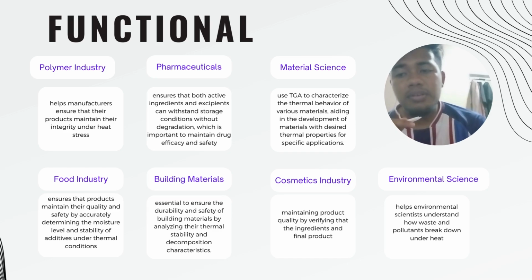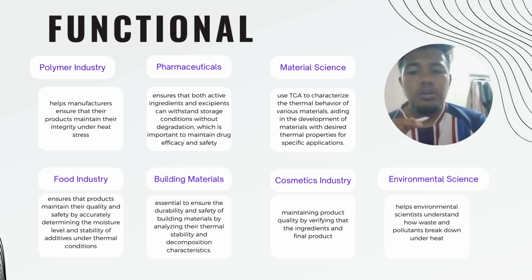Seven, cosmetic industry. In the cosmetic industry, TGA helps maintain product quality by verifying that ingredients and final products can withstand expected storage and use conditions without degrading.